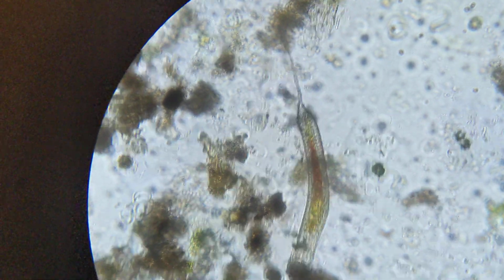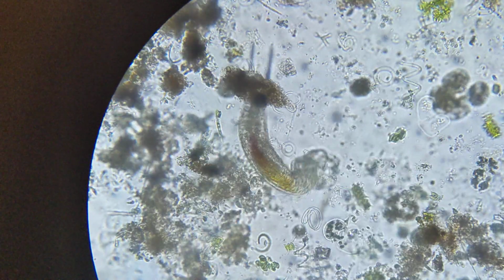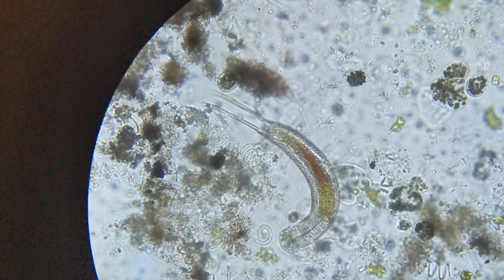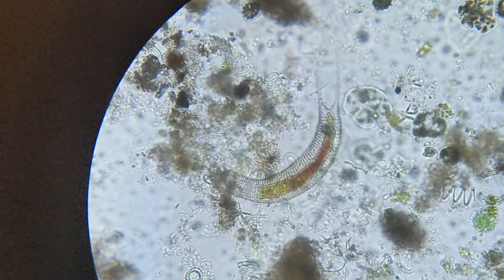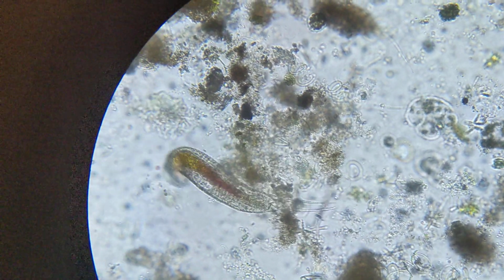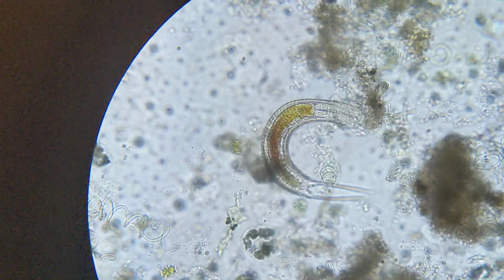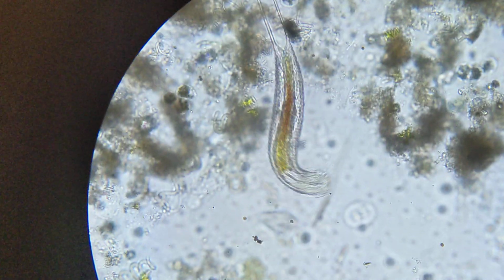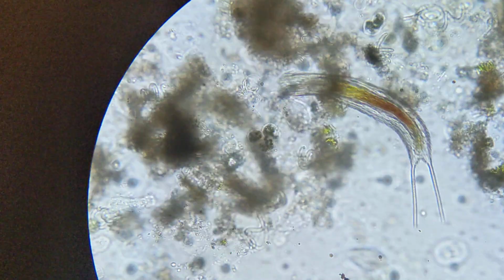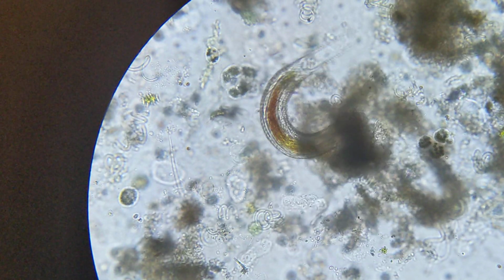And I still might be mispronouncing that. It might be gastrotrich with a CH at the end, or possibly with a T at the end. It's not in my daily vocabulary because I haven't seen one before. Or rather, I haven't seen one in person before. I've seen them in videos online. So that is a pretty neat thing that I've just found in this slide. And I realize that there's other stuff that flits around through the background, but this is interesting enough that I want to keep tracking it for a while longer.